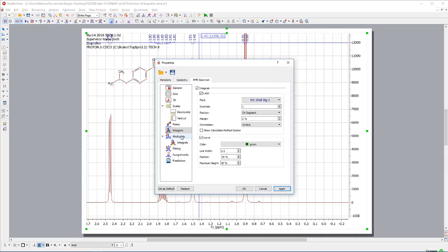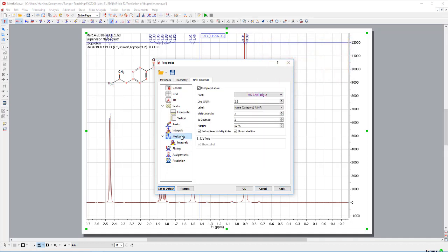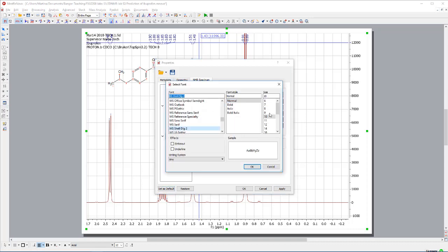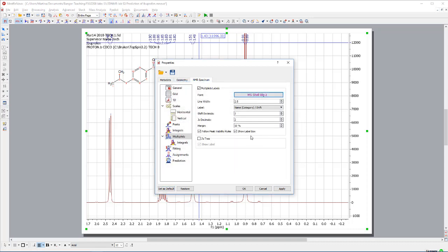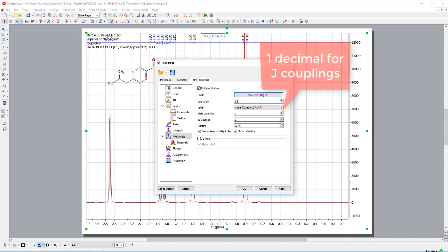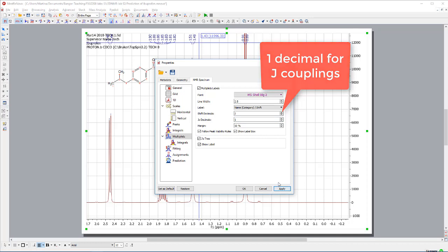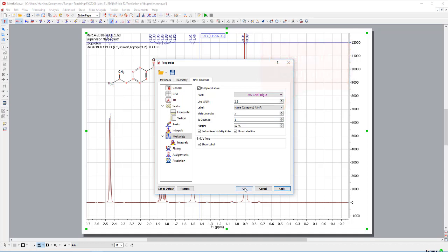And if I want to do multiplets, do exactly the same thing. Select font. It's already on 10. That's good. And for the multiplets again, I need two decimals for the shift. And for the J couplings, I'm absolutely happy with only one. And maybe I want to see the J trees as well. Apply. But this should be fairly okay.